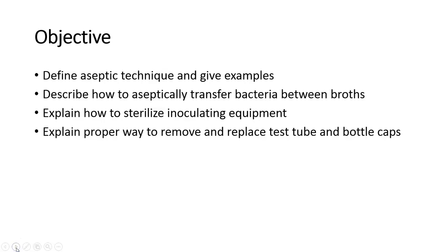By the end of this video, you should be able to describe the term aseptic technique and give some examples. You should also be able to describe how to aseptically transfer bacteria between broths, and you should be able to explain how to sterilize inoculating equipment. Finally, you should be able to explain the proper way to remove and replace test tube and bottle caps.